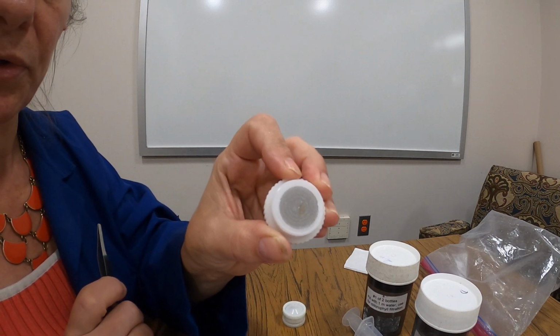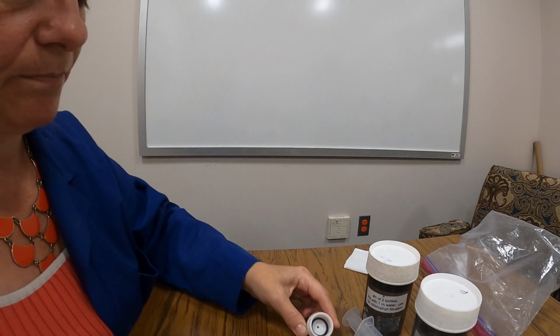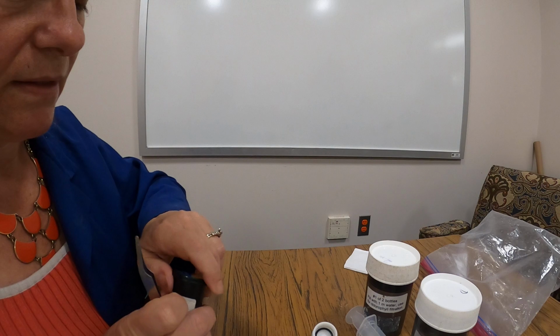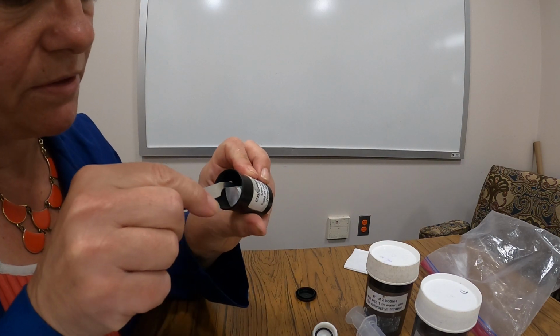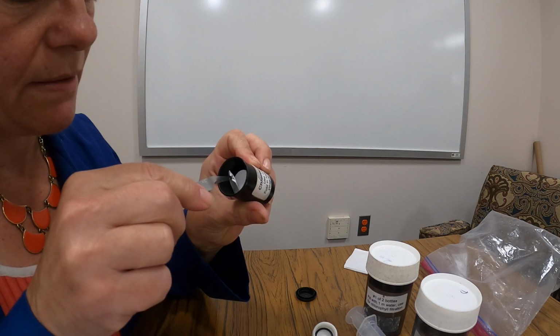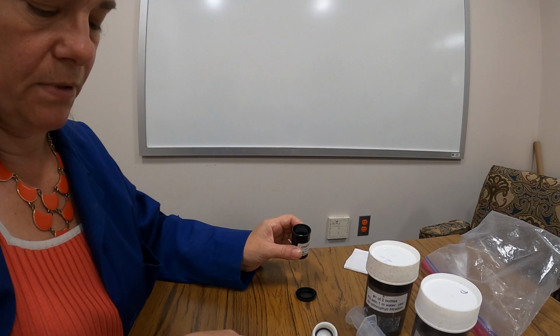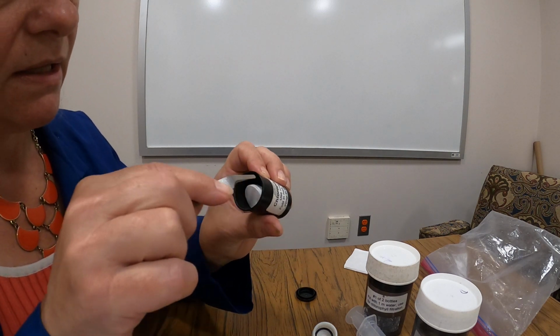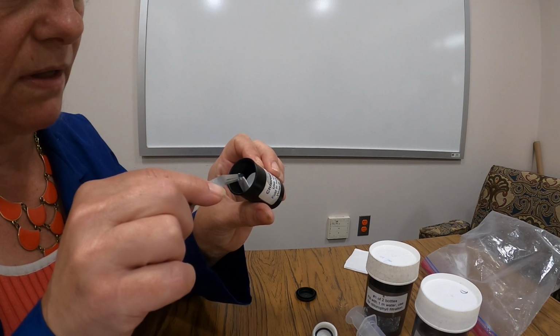The filter holders have this screen. We can go ahead, take the other one off. There's my screen, my O-ring, put those aside. And then carefully, again using my forceps, I'm going to try and separate out 1 filter. Put that on my screen. I'm going to take a second filter, being careful to get only 1 filter.